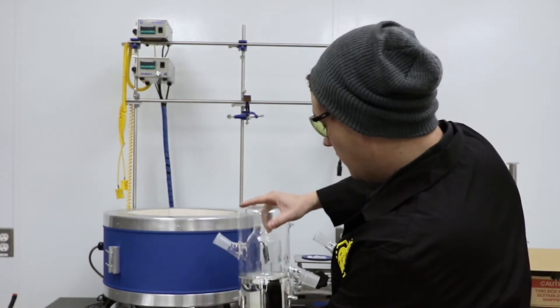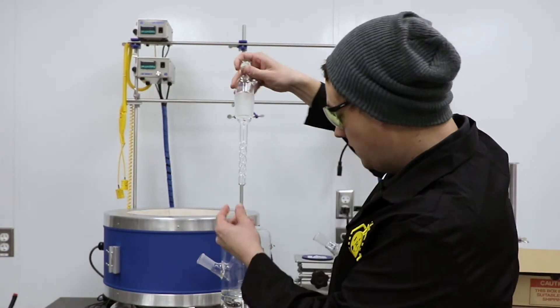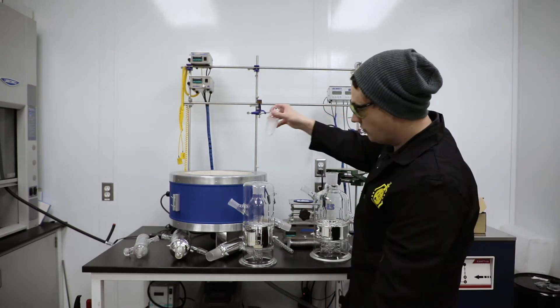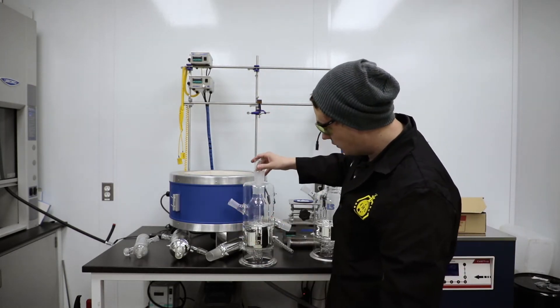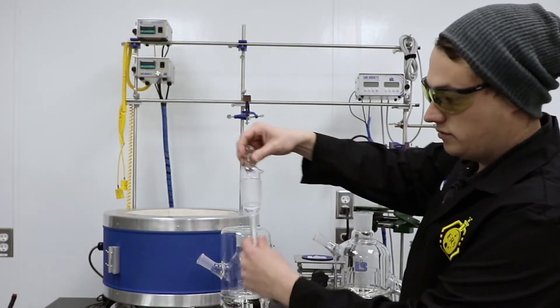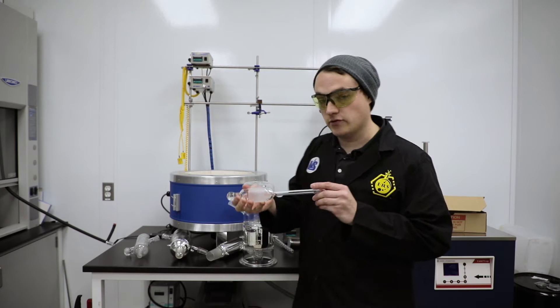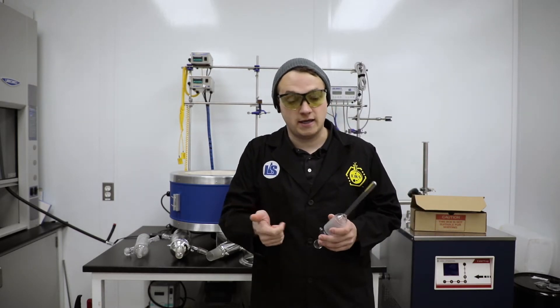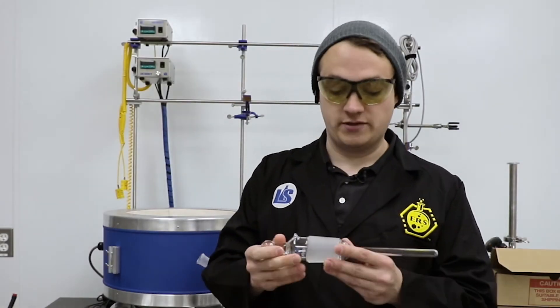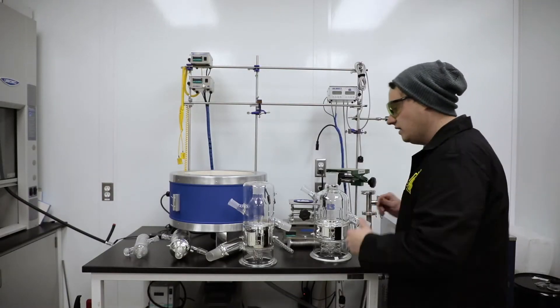The things that we tested were an array of different inserts. We have a reverse Vigreux indent insert — we tested that. We tested just a thermal well with no jacketing or fluid or anything. We tested a vacuum-jacketed version — literally just a vacuum finger. What we learned through that testing process is that all of these create different reflux ratios, which we've seen through structured packing and different types of distillation head inserts throughout the years. Obviously there are other brands that have similar types of inserts, but all of these change the reflux ratio.